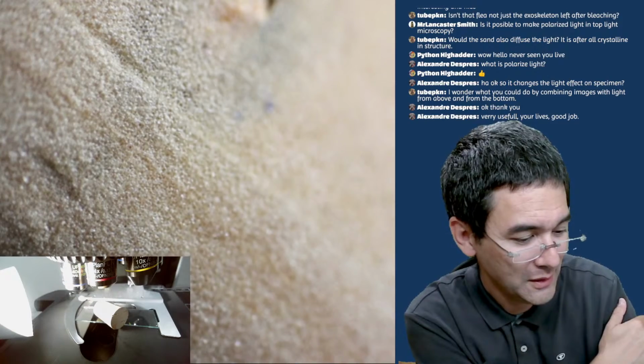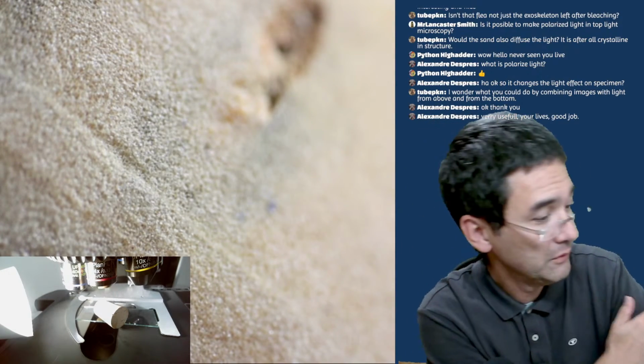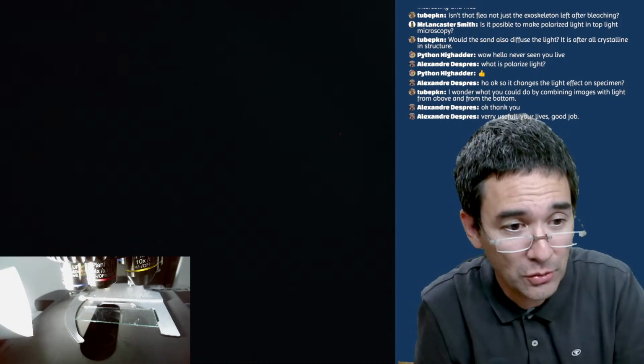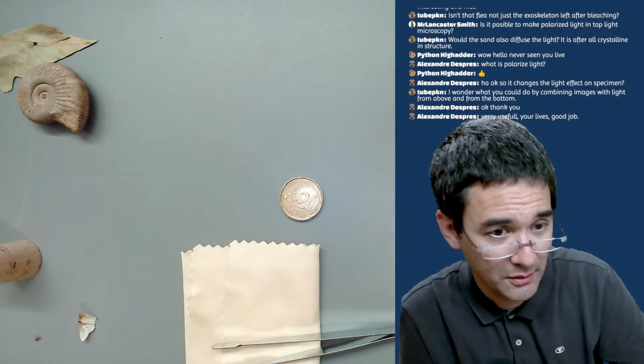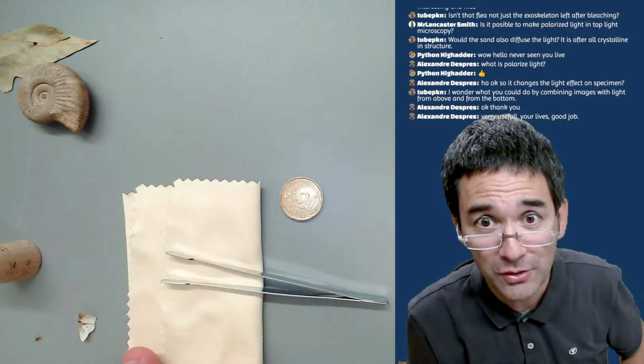So these were all my specimens that I had, honestly. I just wanted to kind of motivate you a little bit to try out these types of things as well. Do you have any questions or any comments?